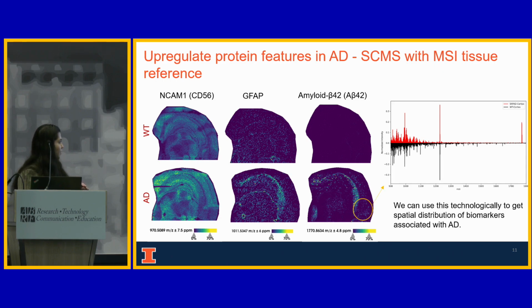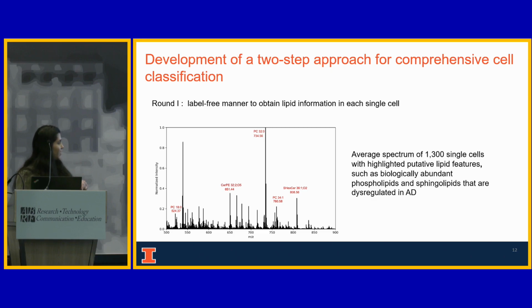And we can also dissociate single cells from the tissue of a specific region and study Alzheimer's disease with mass spectrometry imaging at single cell scale. This is basically a spectrum of a cortex region of the brain of an Alzheimer's disease mouse compared to its wild type.